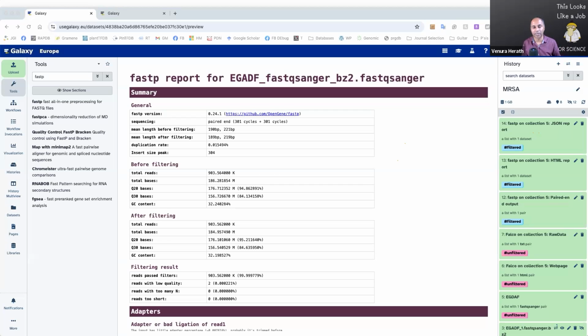This is a very optimized tool that you can use in order to analyze your outputs, especially if you do metagenomic studies. This is one of the go-to tools people use for identification, and that way you can map to the common ancestors based on the species tree. So it's a pretty cool tool.